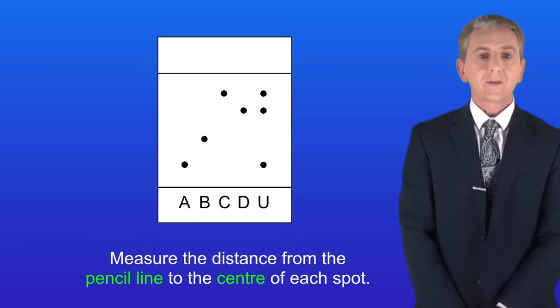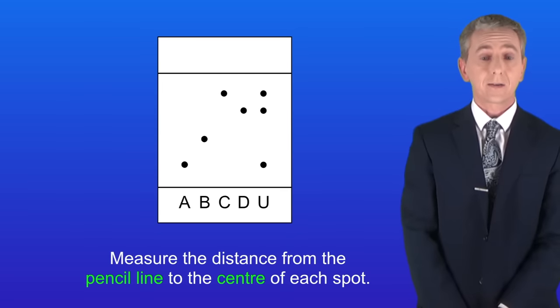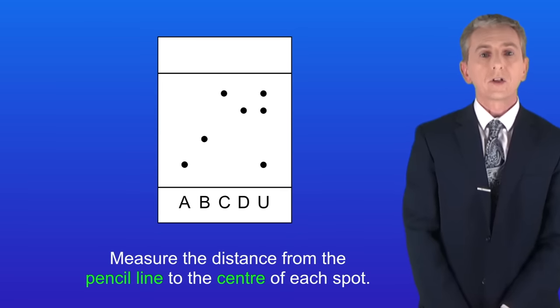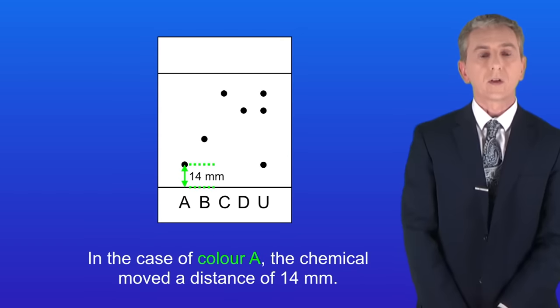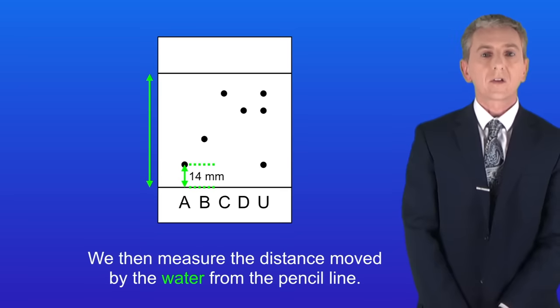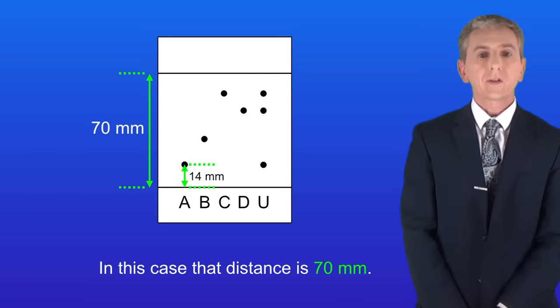The first thing we need to do is measure the distance from the pencil line to the center of each spot. I'm going to do that for the spot produced by color A. In this case the chemical moves a distance of 14 millimeters. We then measure the distance moved by the water from the pencil line. In this case that distance is 70 millimeters.